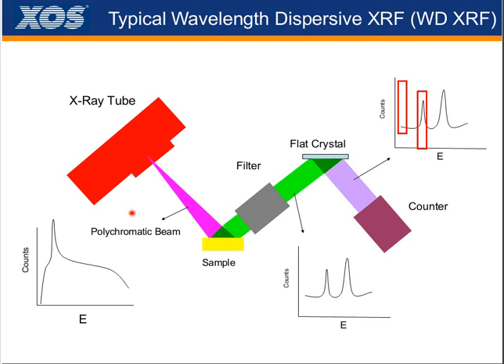And what's happening there is they're trying to get as many counts as possible out of this system. So by the time they go through these filters, they still get good peaks. You can see here, they do get good peaks. They get a little less background, but what they're doing is using a higher powered tube to push this peak above the background. And then on the back end, they're trying to get a clean peak by using these crystals, these filters.